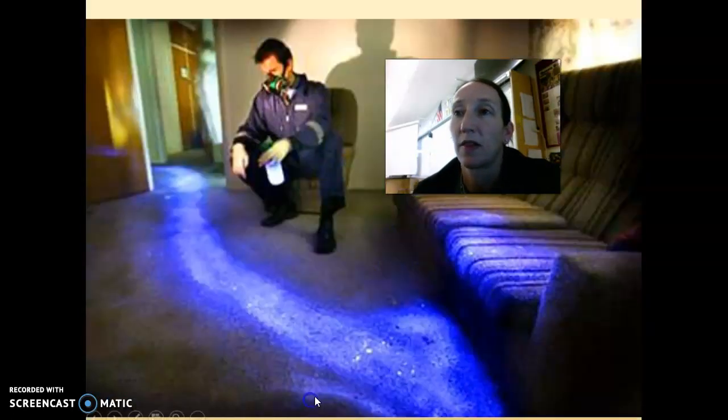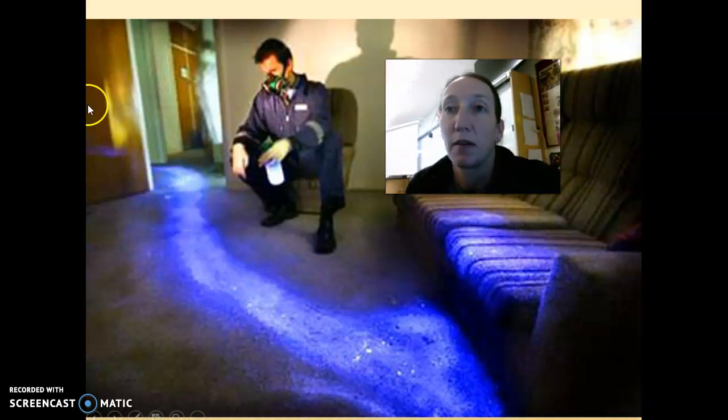Anyway, the thing that I like about this picture is you can actually see the torso, upper body, the head, the arms, and then it looks like this victim was dragged out. Now, how bright, brilliant blue it is leads you to believe that they were badly wounded, because that's a lot of blood coming off and being dragged out. And then it looks as though the victim was sitting or lying on the couch, because you have an amount of blood that happened here as well.